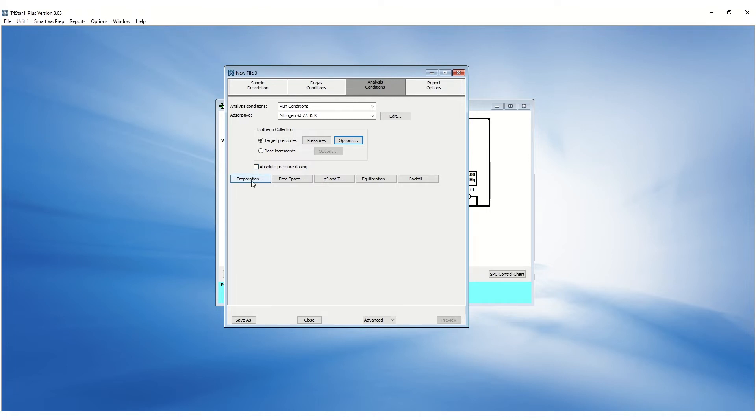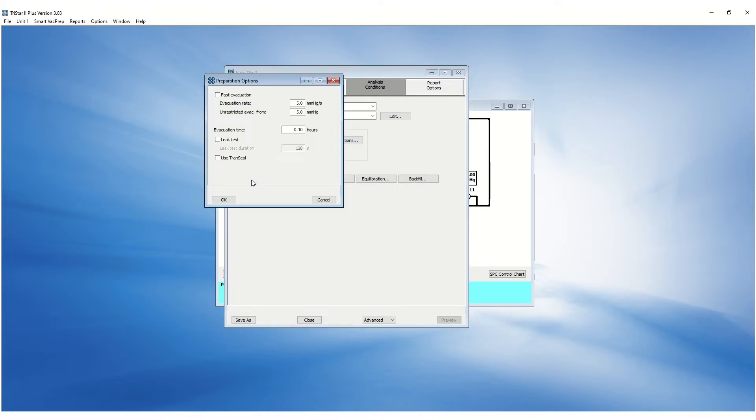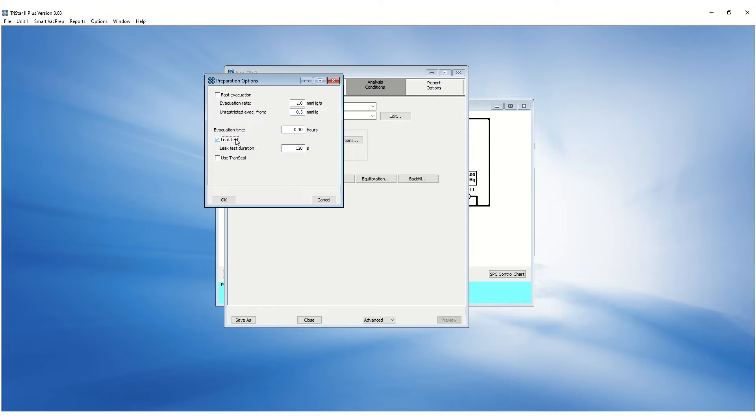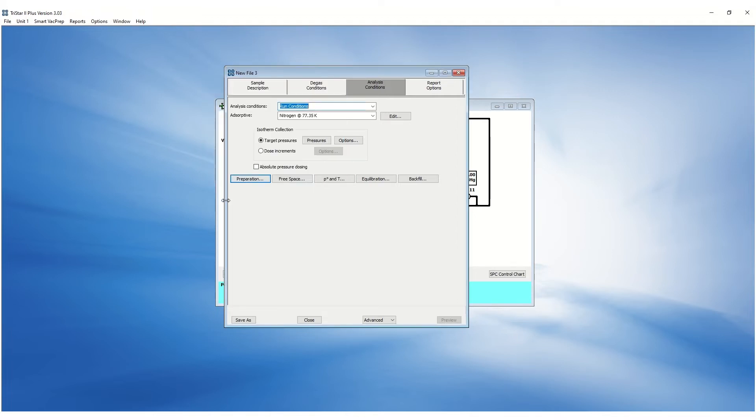Preparation options allow customization of evacuation rate. The evacuation rate adjustment is necessary for fine powders to prevent fluidizing samples. The leak test is available to detect any leak before starting the analysis.